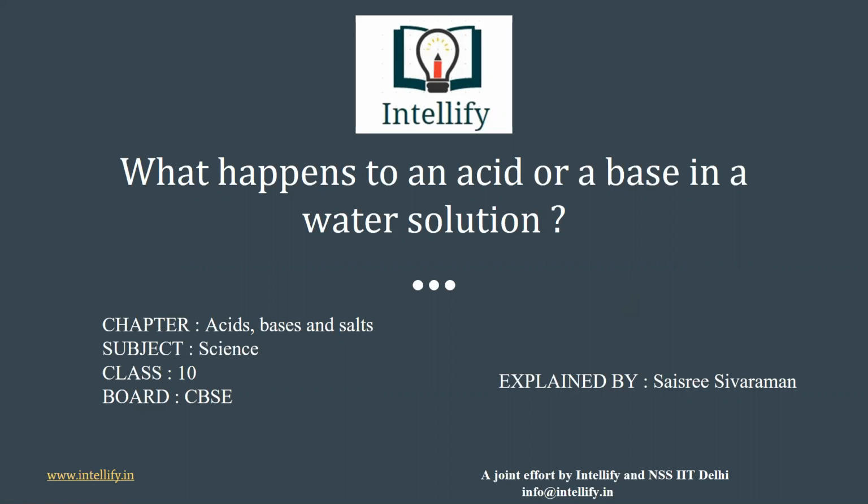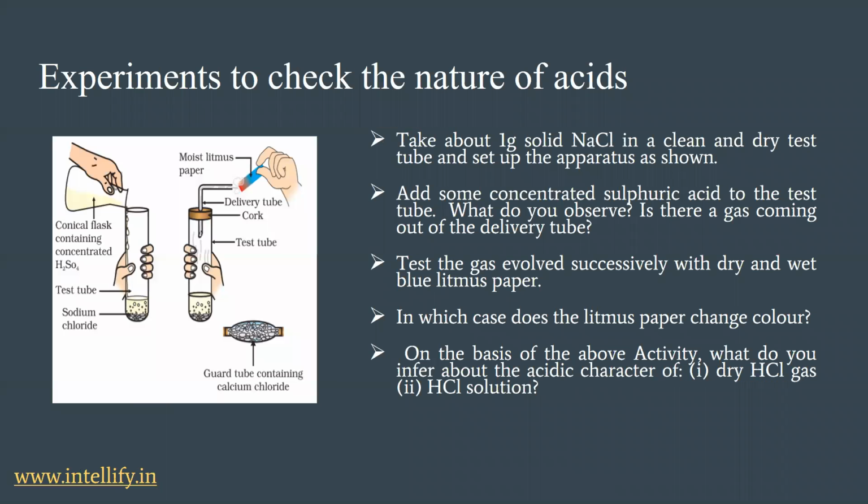Hi students, the topic is about what happens to an acid or a base in a water solution. Let us do some experiments to check the nature of acids. Take about 1 gram solid sodium chloride in a clean and dry test tube and set the apparatus as shown.